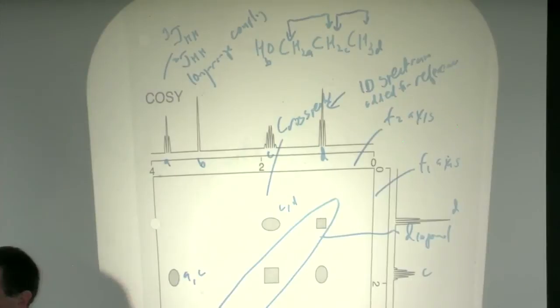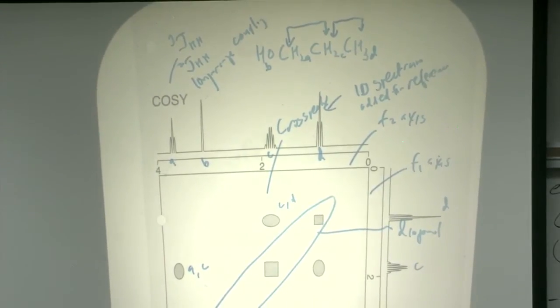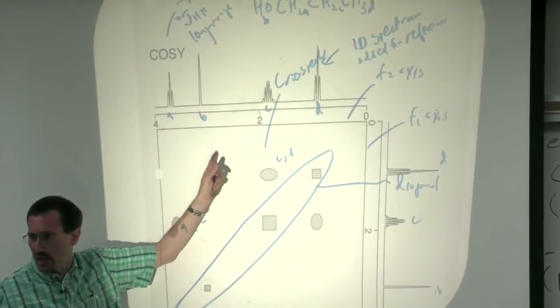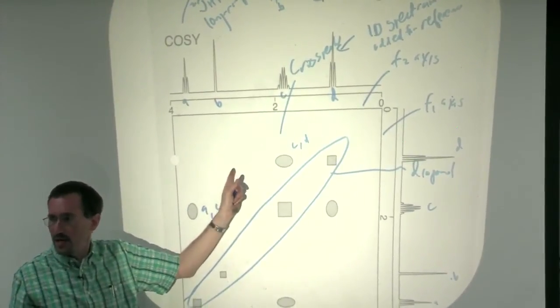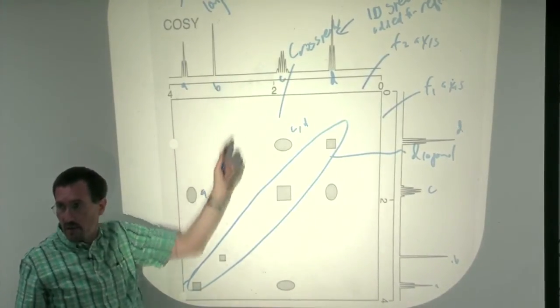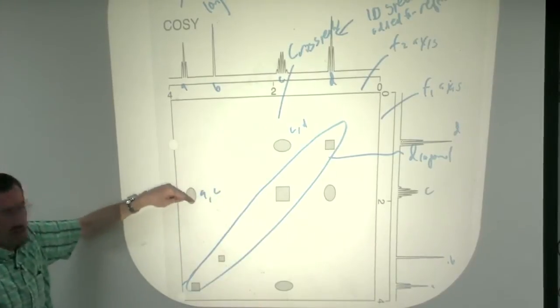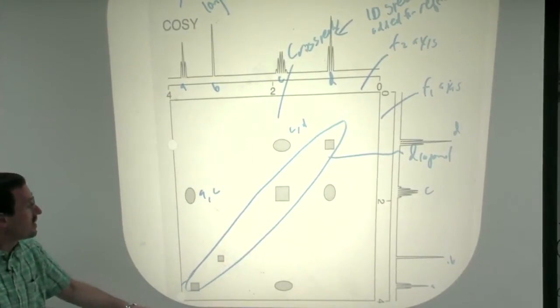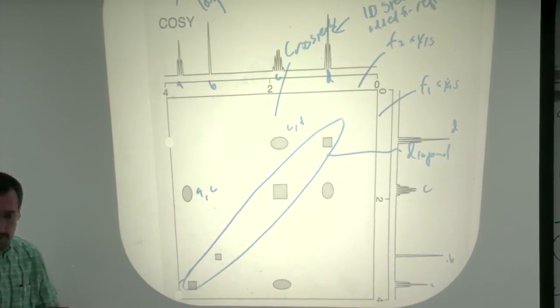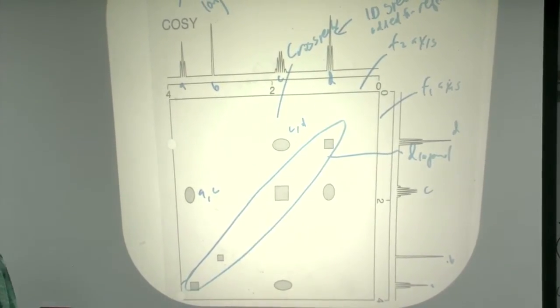And we can see in this particular simulated spectrum, this particular, I should say, sketch of a spectrum, B, because it's not J-coupled, isn't coupling to anything. If B were a triplet, if it were J-coupling, then we would expect it to give a cross peak with A. And so we'd see a separate peak over here associated with that coupling. All right, so that's our COSY spectrum. So now let me show you our HMQC spectrum.